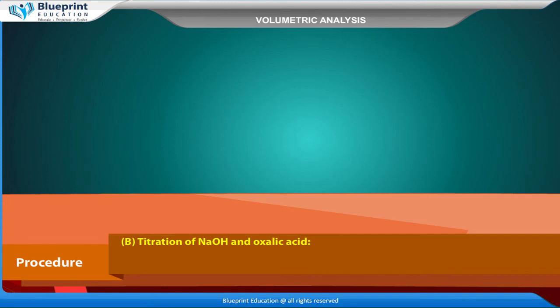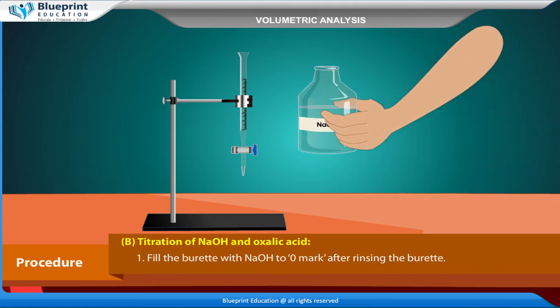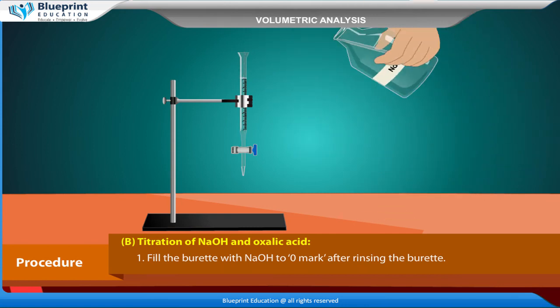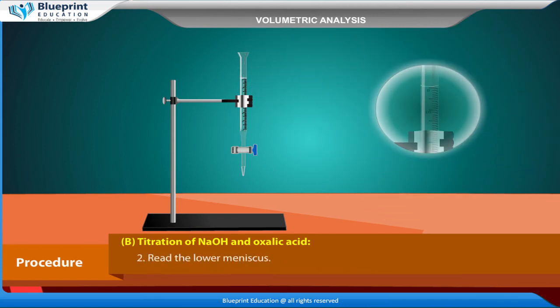Titration of NaOH and oxalic acid: Fill the burette with NaOH to 0 mark after rinsing the burette. Read the lower meniscus.